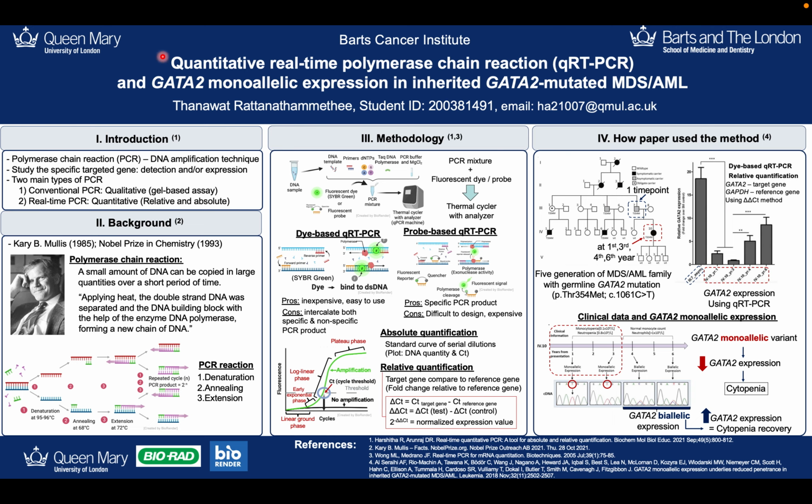My name is Thanawat. Today I will present the quantitative real-time polymerase chain reaction, or RT-PCR, and GATA2 mono allele expression in inherited GATA2-mutated MDS/AML. PCR is the method to increase the targeted DNA sequences. This technique is very important in terms of gene detection and expression.